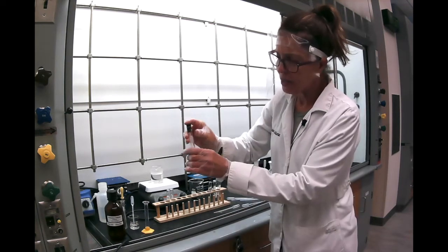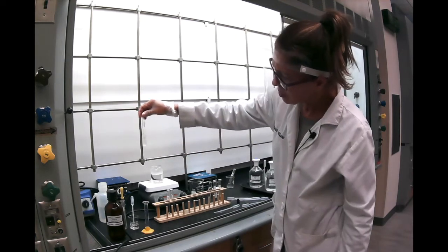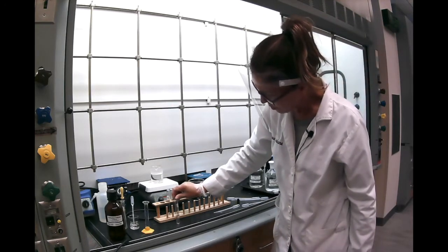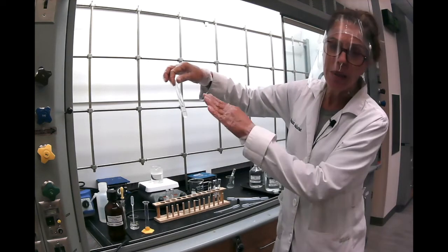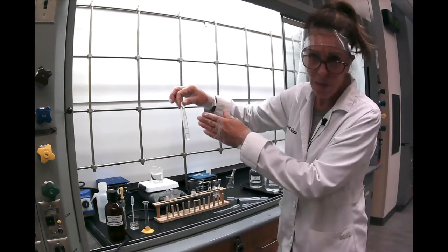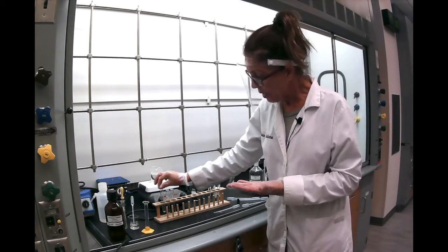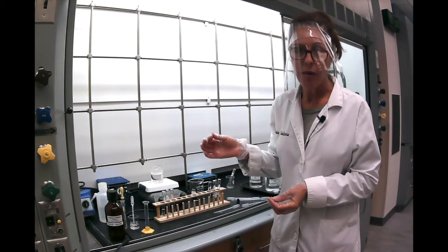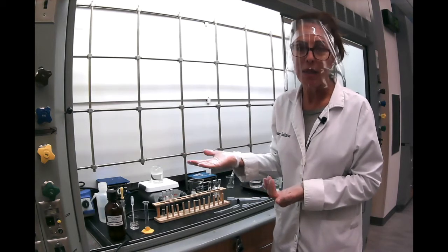And it looks like they're already dissolved, so all you have to do is just let it sit for the layers to separate. See, we want to remove all the bubbles. So as you can see, the benzoic acid is gone. We want to know how much of it is in the water, how much of it is in the methylene chloride. Instead of collecting both layers, the water and the methylene chloride, we can just take out the water layer and then dry out the methylene chloride layer and then evaporate the methylene chloride.